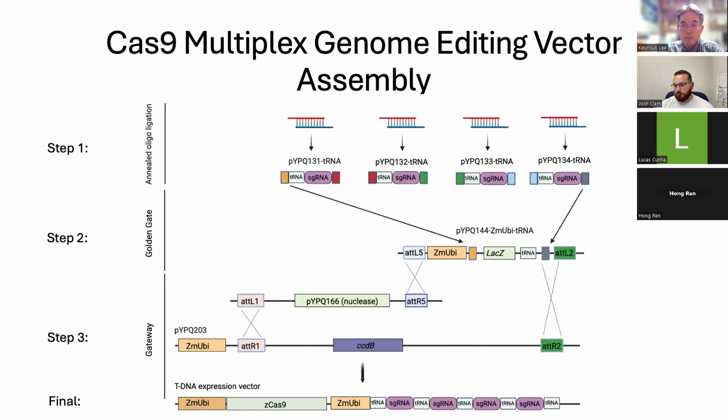I see. Do you have a recommendation for monocot or dicot, the best potential terminator we can use, if we do not consider the NOS terminator? I think another one. I don't do much genome editing in dicots myself, actually. I think the 35S terminator would be an adequate one. Maybe Keunsub, do you have any recommendation for that?